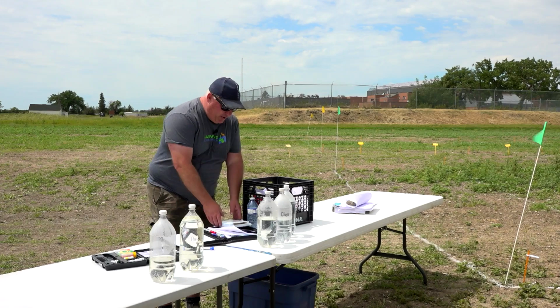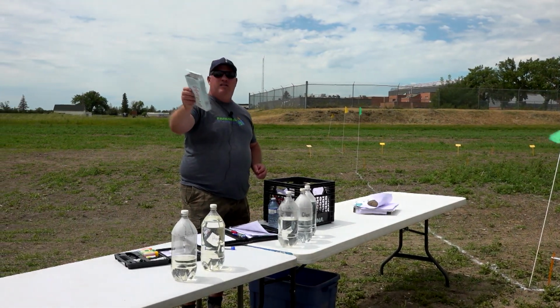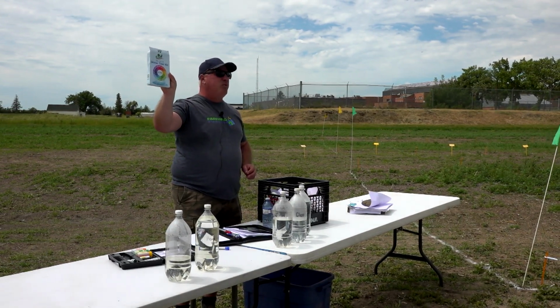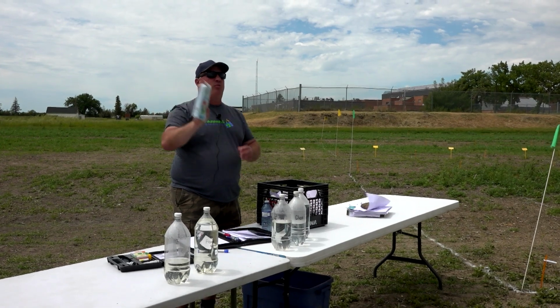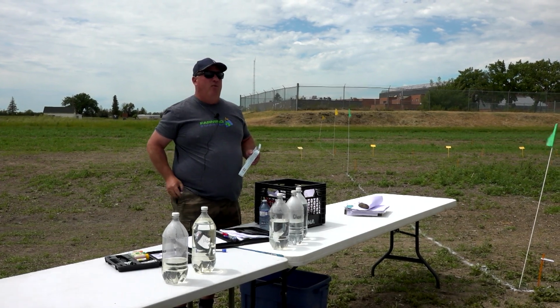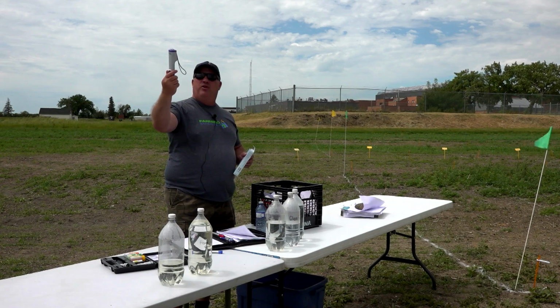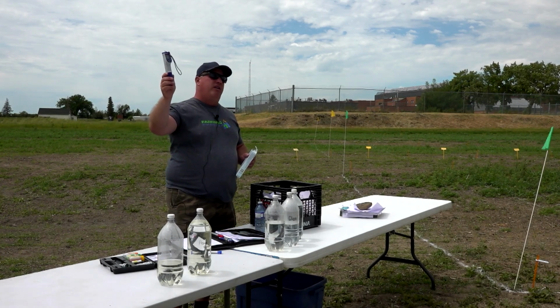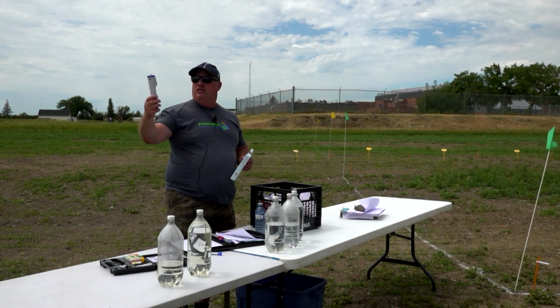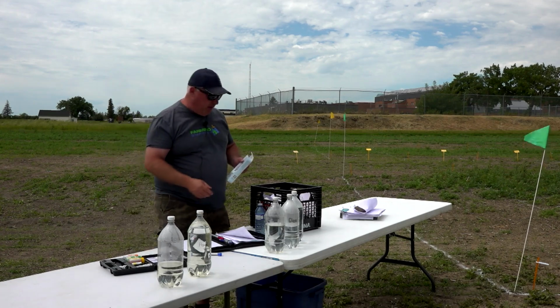The EC test, what we're going to do right now actually is give you guys a chance to try these out. This is a 16-in-1 water kit. This is the first, simplest, easiest way to start testing your own water. Super cheap. The other one is to get a little handheld, and it's a little more convenient and a little more accurate. We just picked one of these up. So this will do electroconductivity, total dissolved solids, pH, temperature, something else that I can't remember. Probably not that important.